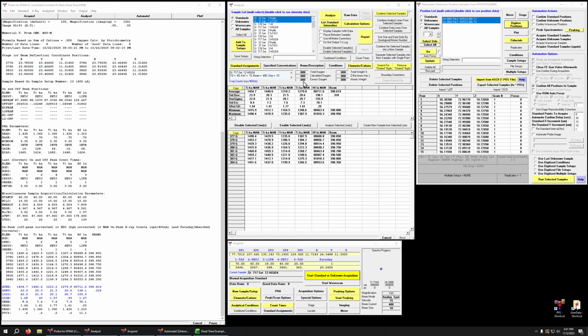So it needs to be tough, and it needs to have two standards with approximately a factor of 2 to 4 difference in concentration. Also make sure it's something that's going to give you the count rates that you need. In terms of my instrument, I have PET crystals on all 5 channels, so with just one pair of standards I could measure my dead times.